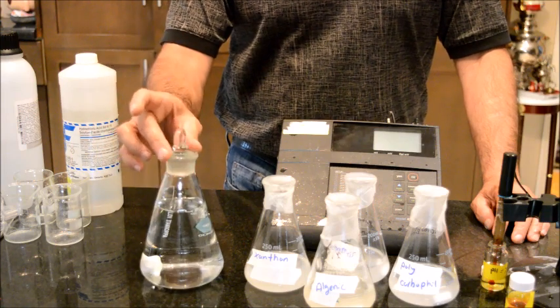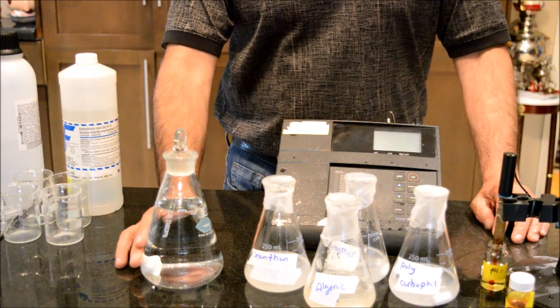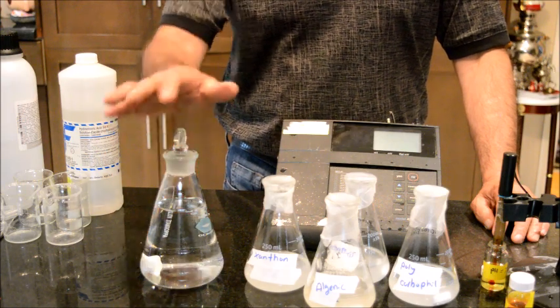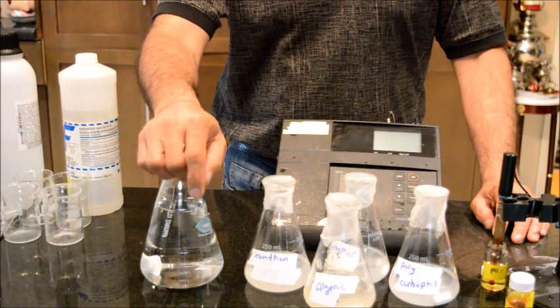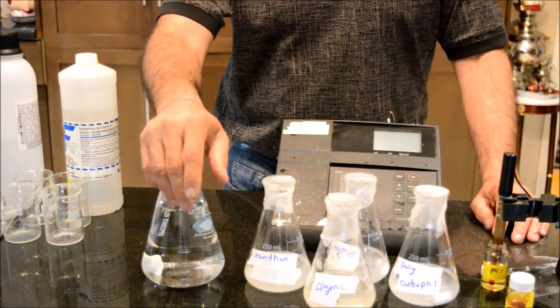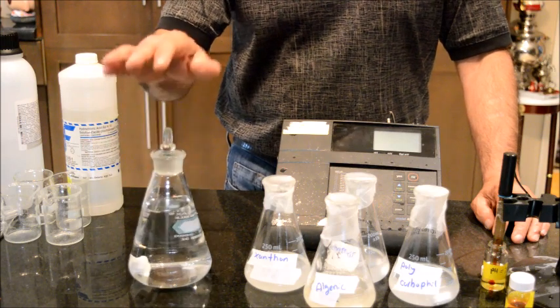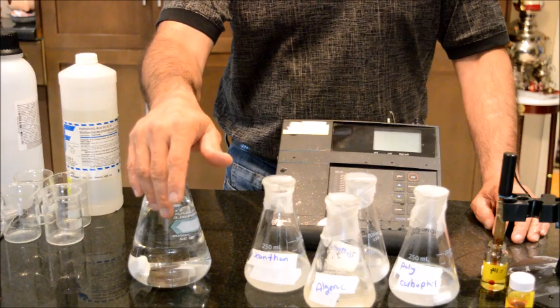Now the simulated vaginal fluid pH is around 4.2. So the pH of the vaginal fluid of a healthy individual is 4.2, and as the person is infected with bacteria or fungi, the pH rises to 7.2 or 7 or 6.8 depending on the infection. But for this video, I'm going to stick with the pH 4.2, representative of a healthy individual.